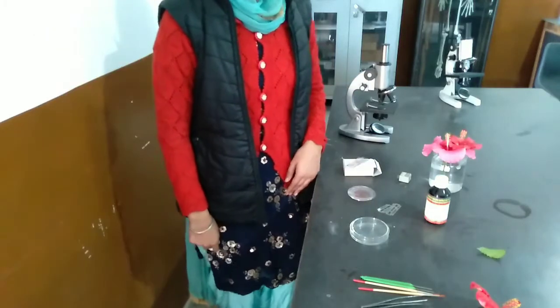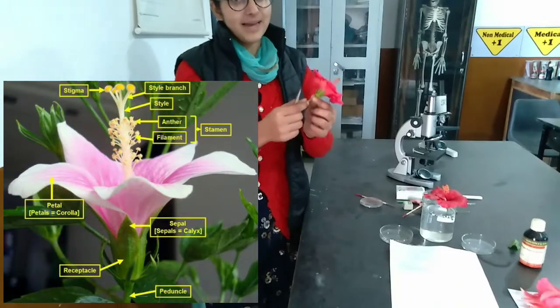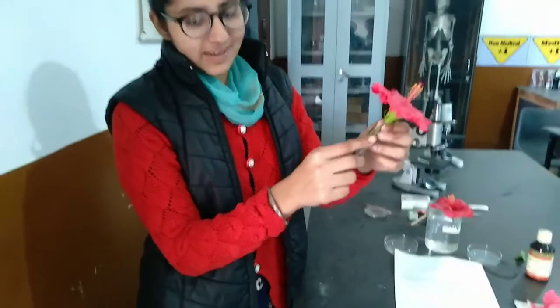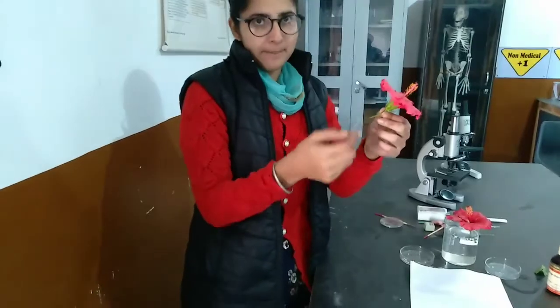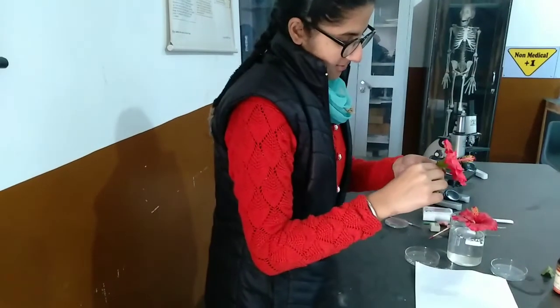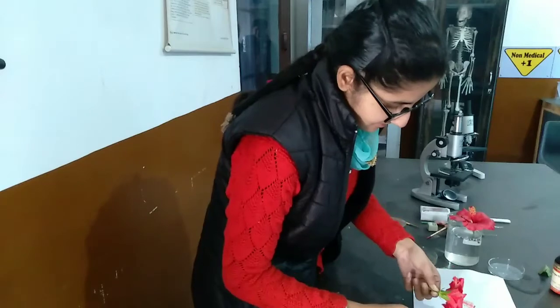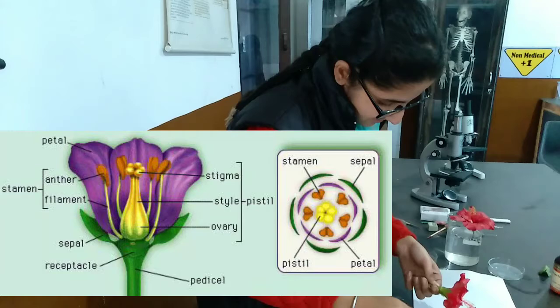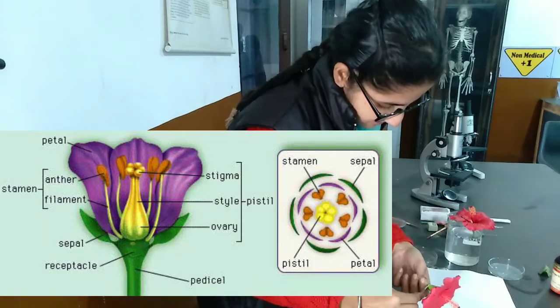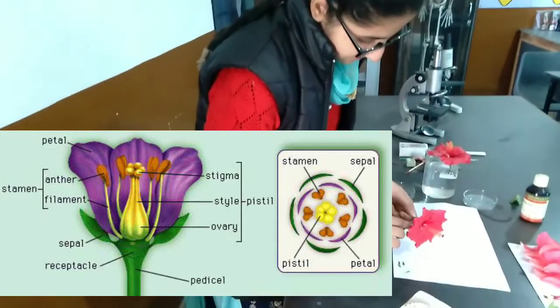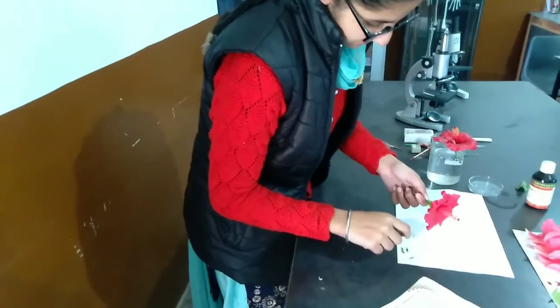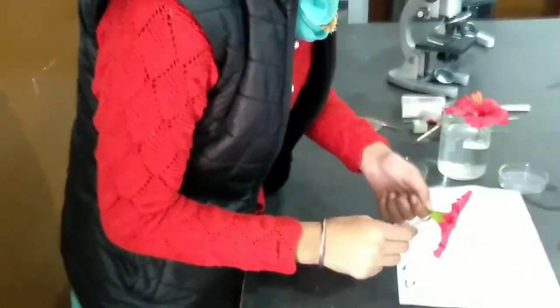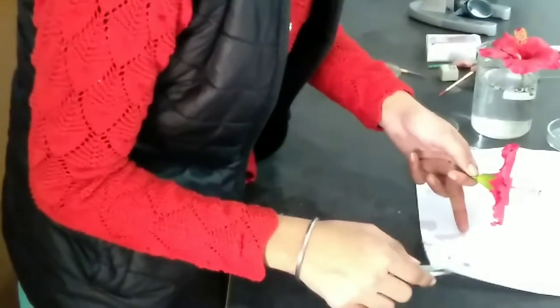Now we are going to perform the experiment. First, we are going to remove the epicalyx.